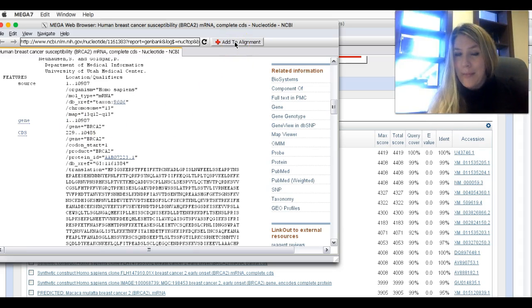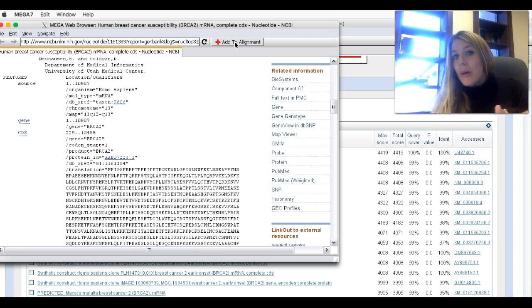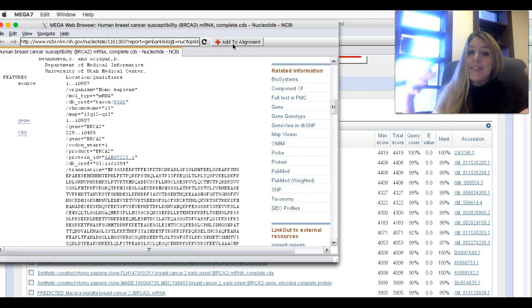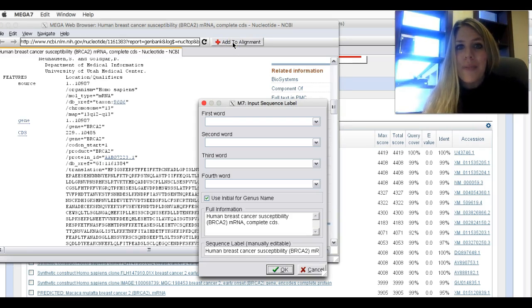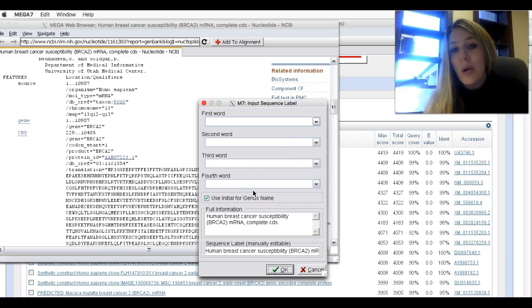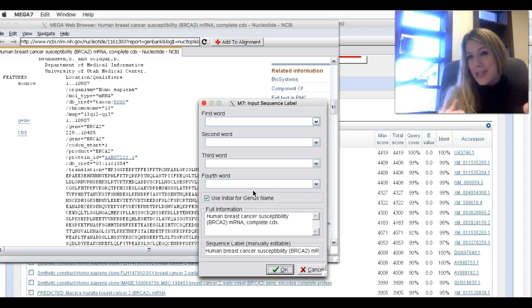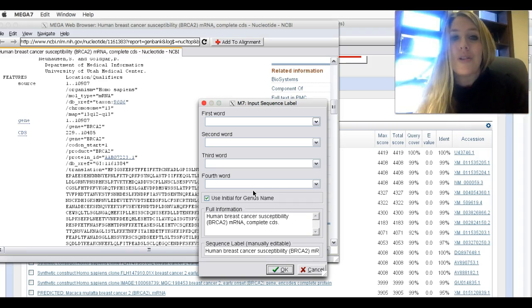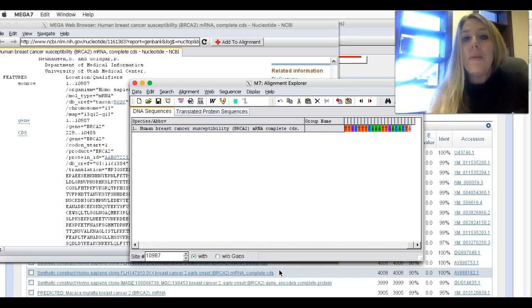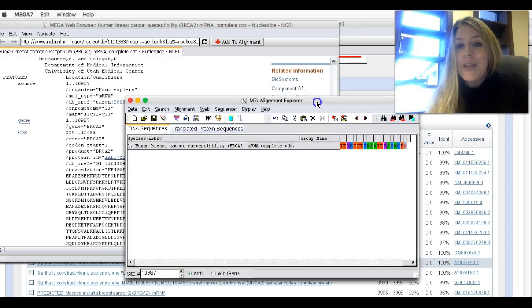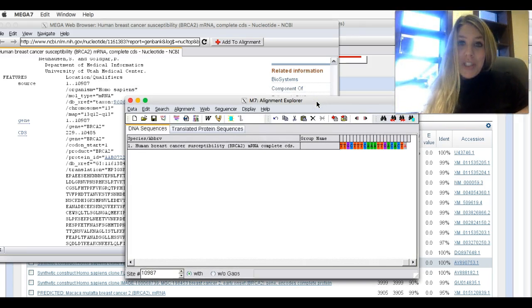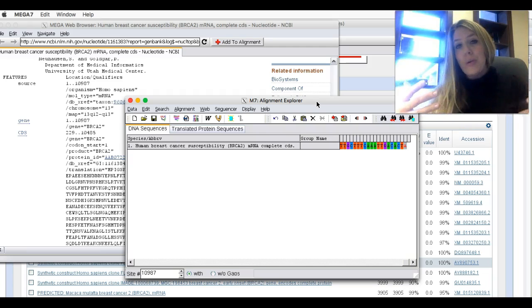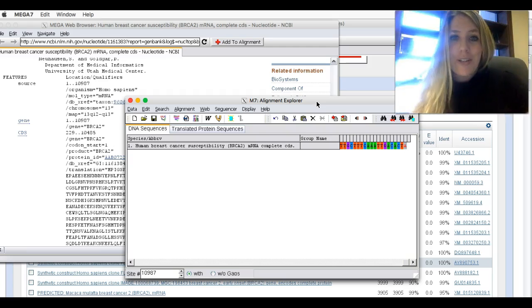Once you've done that, click Add to Alignment. If you went to this website directly from Google, it won't have this Add to Alignment button. So you have to get into the NCBI from within the mega software. Click on Add to Alignment, and it pulls this sequence label up. Just hit OK. And up comes the Alignment Explorer. This is where we're going to be downloading these DNA sequences for different species into. And then we're eventually going to align these sequences to create our phylogenetic tree.